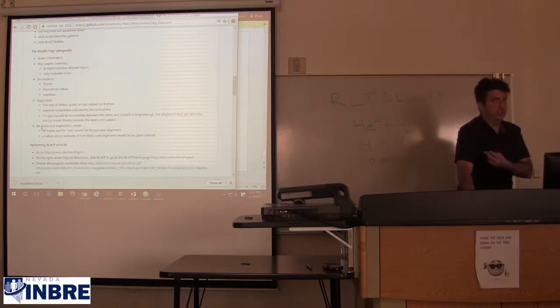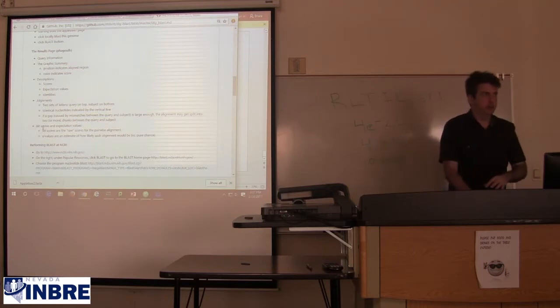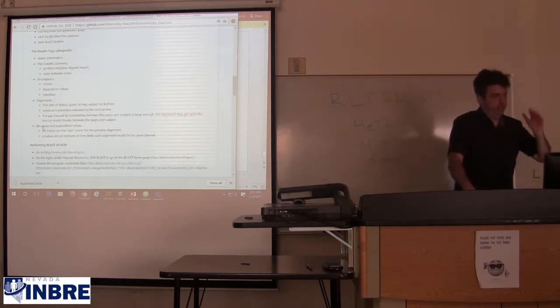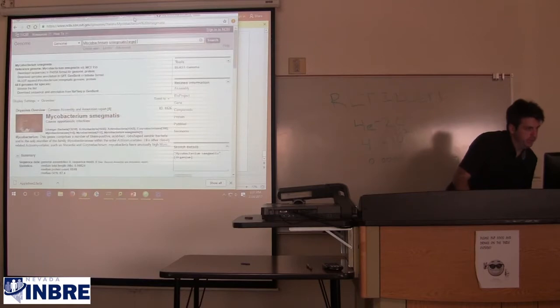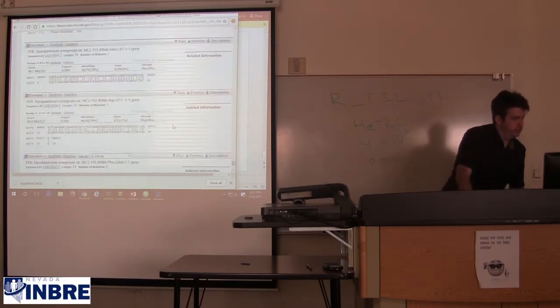When we looked at genes listed at NCBI, we saw primarily aminoacyl tRNA genes, one operon, and in my unlimited results, I saw some other gene, something synthase, but it was primarily dominated by these tRNA genes.